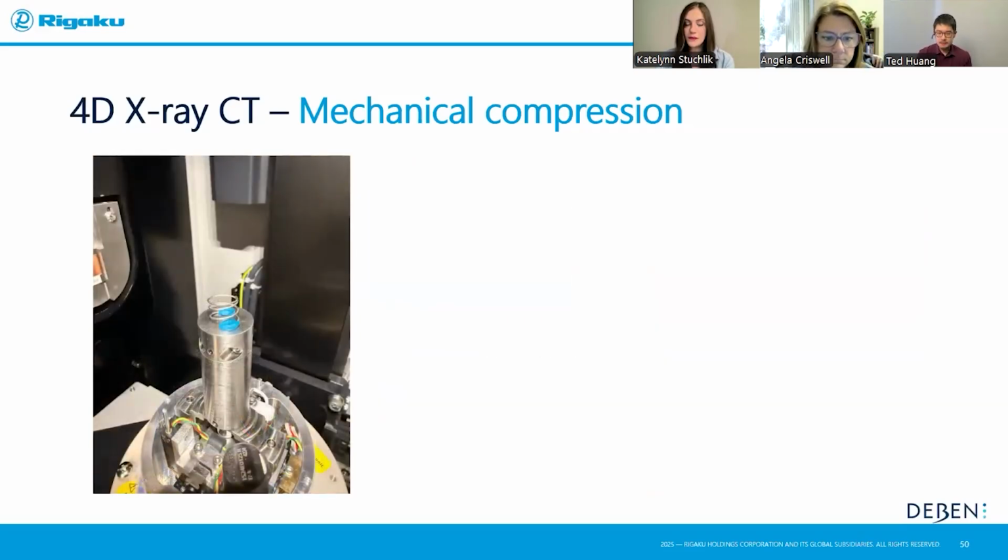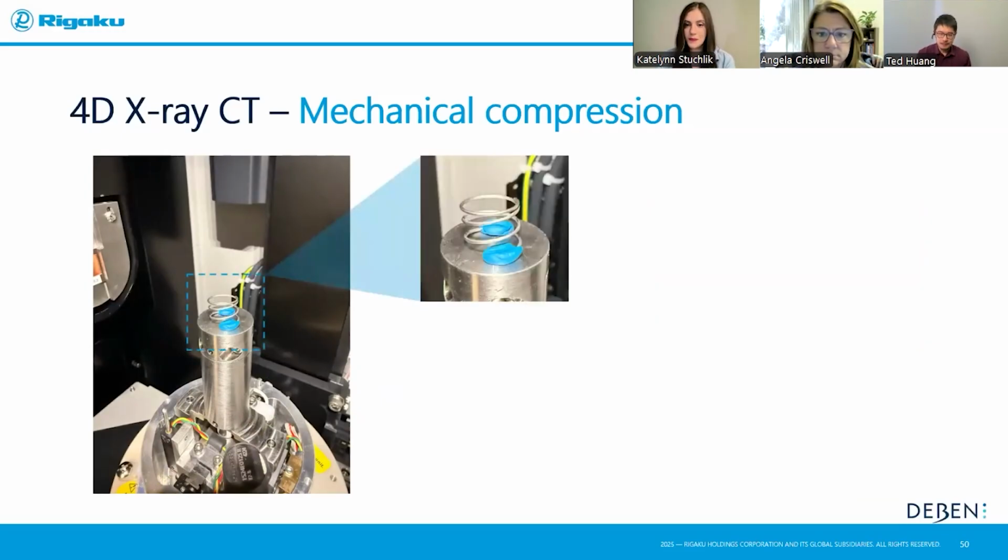Now, for here, this is the sample I put on. In this case, I just want to showcase something being pressed. So let's compress the spring so you can see clearly it's being compressed, right? But then you see something, okay, what is that blue thing on the side? That's not a spring. Those are some putties I put there to prevent movement. Now, this is by no means an elegant way for you to do this. You have to put more thought into it. But let me tell you why I did that at the moment when I was doing this demonstration.